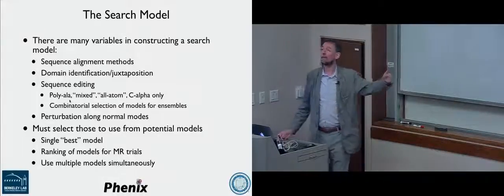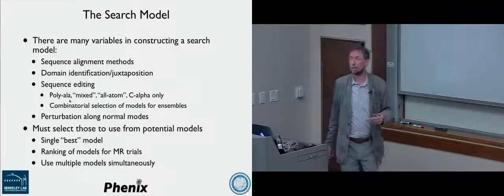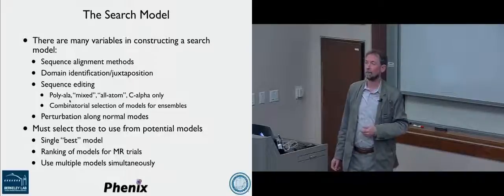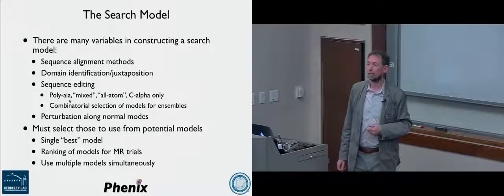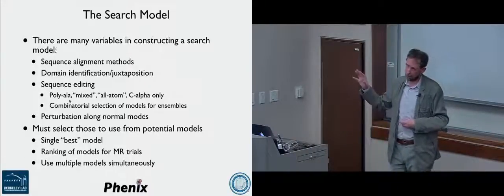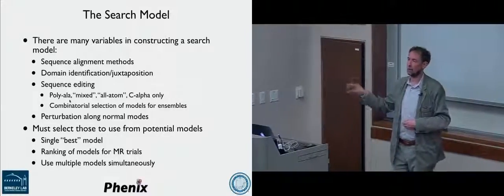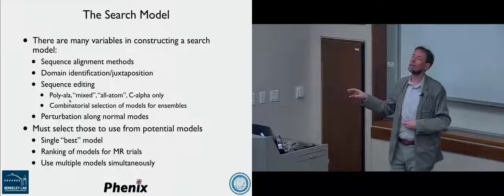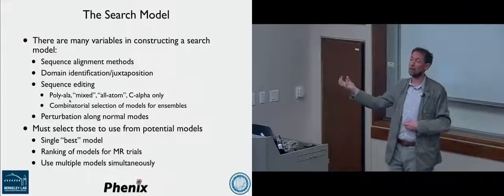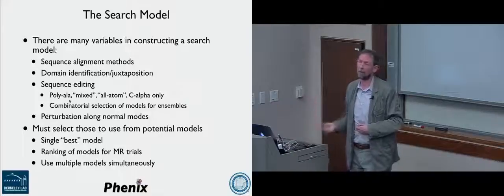So your error model would assume that, okay, I have all the atoms in, I have accounted for all the atoms that I expect to be in. No. That likelihood function can account for the fact that we don't have all of the atoms there. So we can search for a small part or a small fraction of the atoms. That's part of that error model, effectively.